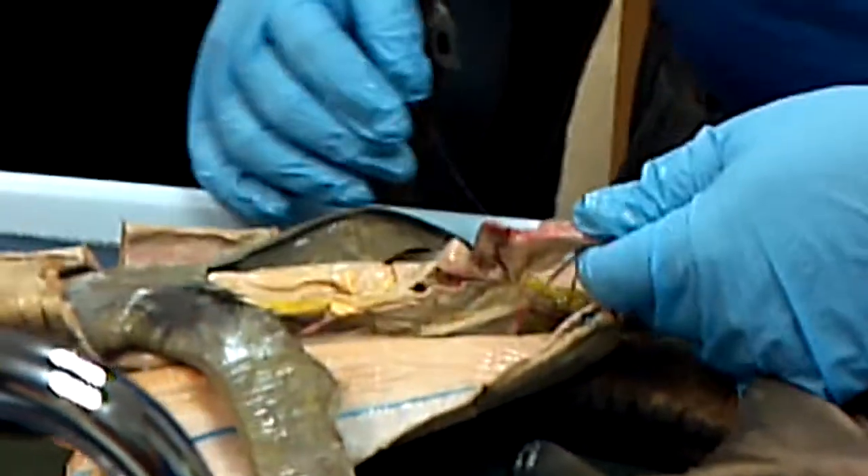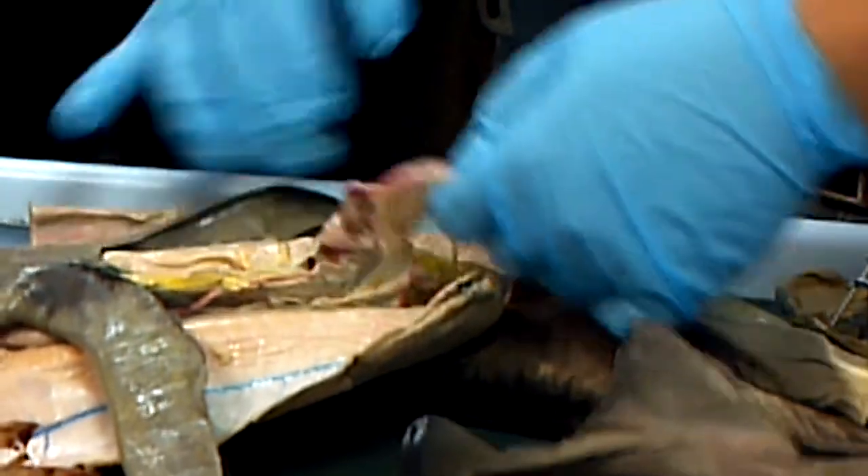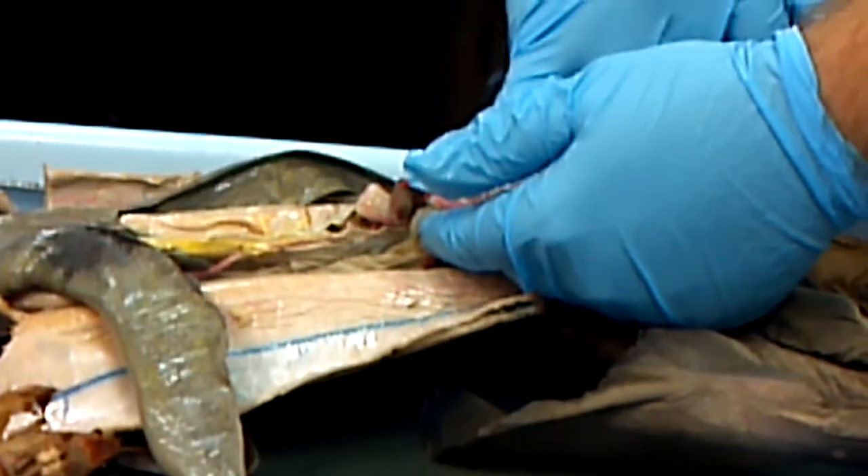Intestine. And they sub-label it, right? Duodenum is the first part. In which case, it's just right where it attaches to the stomach.